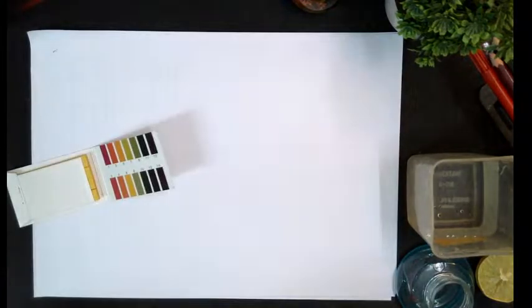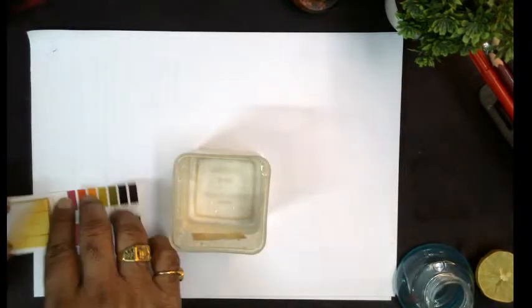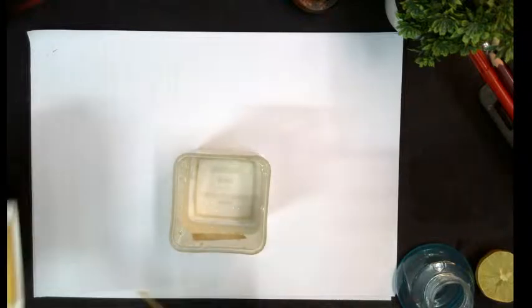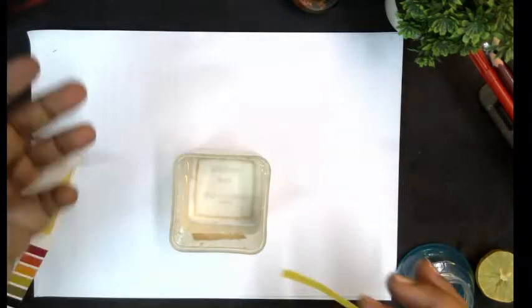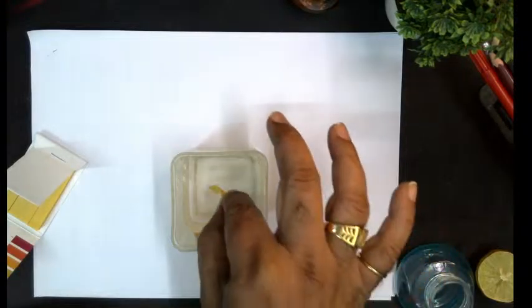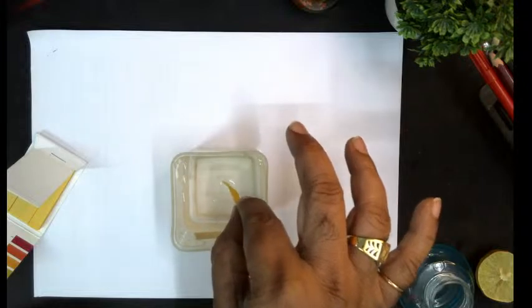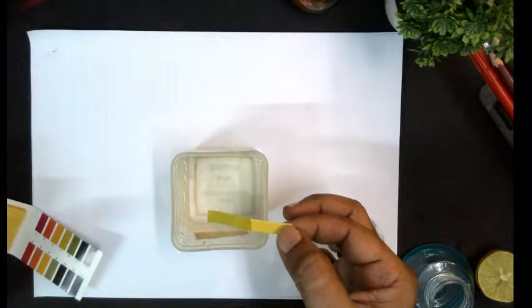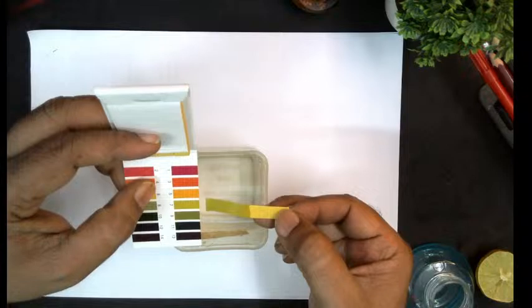For instance, let me take water here, and let us take a pH paper strip. Make sure it is not wet. Now I got the water. Let me dip this strip and check the pH of water. So it is almost pale green. You just don't touch here, just compare the surface. Now the pH is 7.